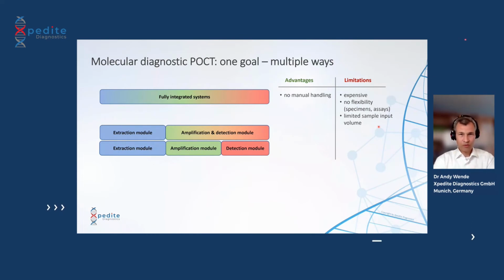And so, of course, you lose assay sensitivity.